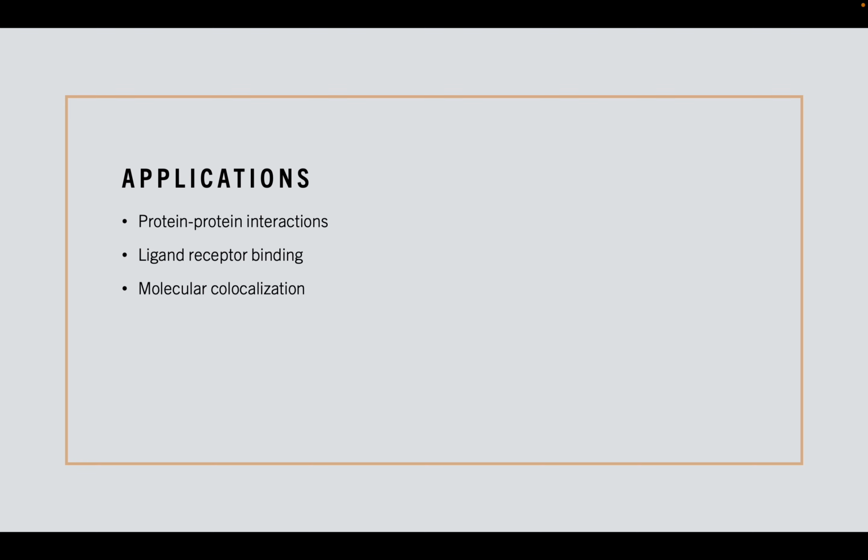And I want to see if protein A is interacting with protein B or not. Suppose I give the excitation energy only for the green one. If these two proteins are interacting, I know that the emission overlaps, and only if they are interacting will the distance between them be small, and only then will they transfer the energy.